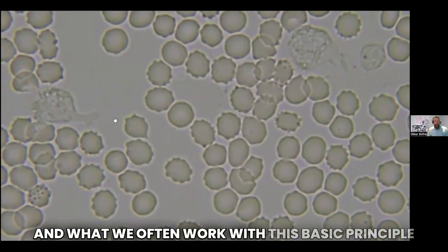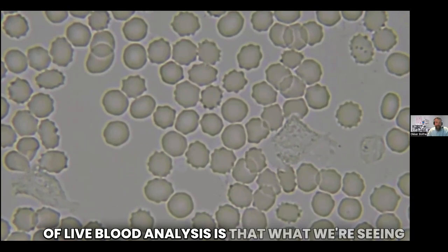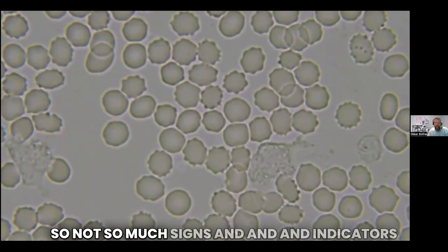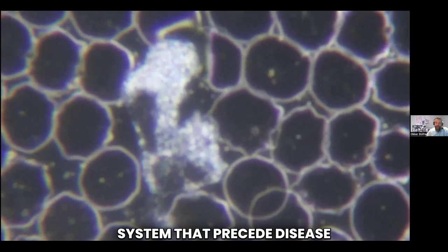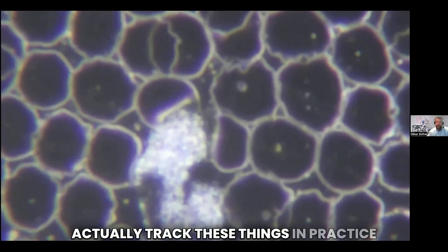And what we often work with, this basic principle of live blood analysis, is that what we're seeing in the blood tells us about the condition of the internal terrain of the body. So not so much the signs and indicators for specific medical conditions, but rather imbalances taking place in the system that precede disease. So really helpful for us to actually track these things in practice.